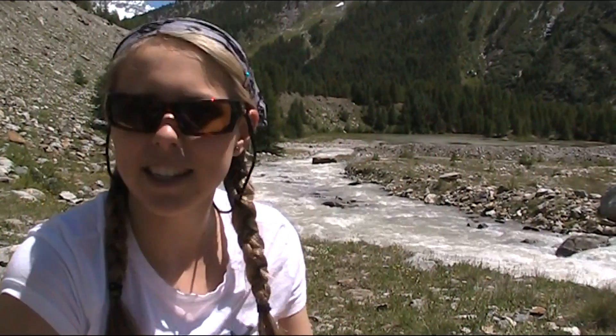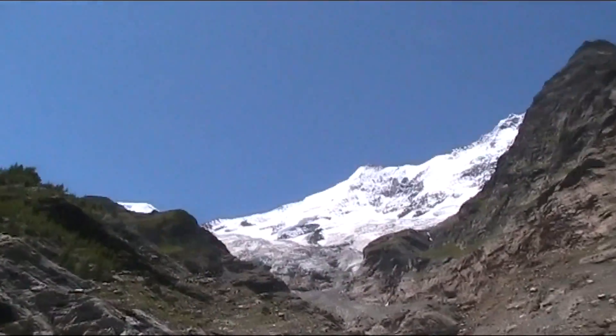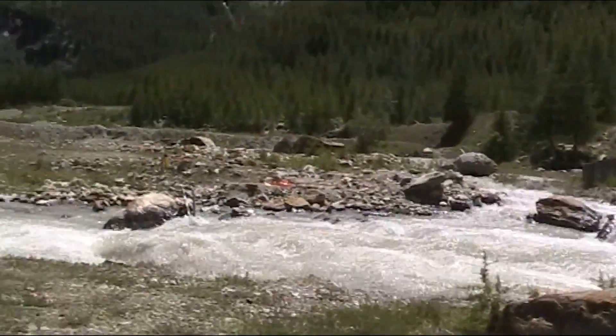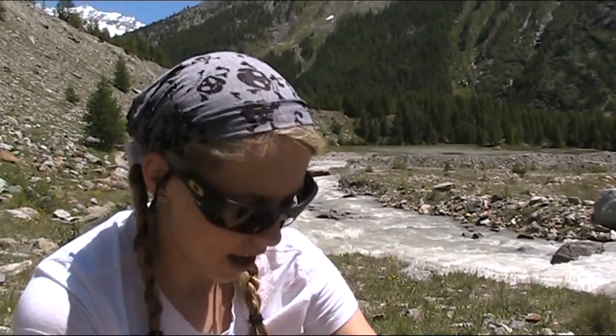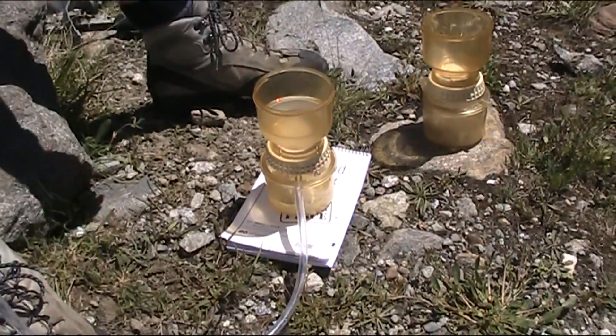My name is Rachel. We are here today at the lower site on the Fade Lecture, Northern Lobe, as you can see up there. We are currently here filtering suspended sediment through these filtration systems, once every 15 minutes.